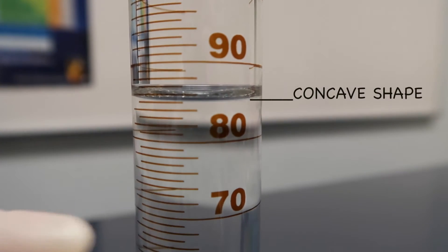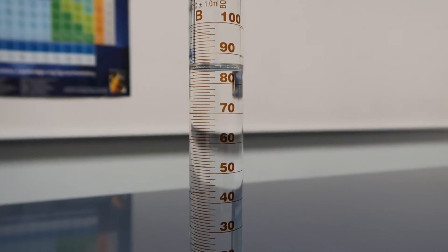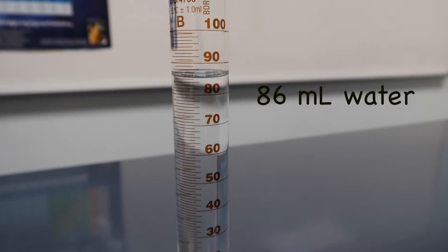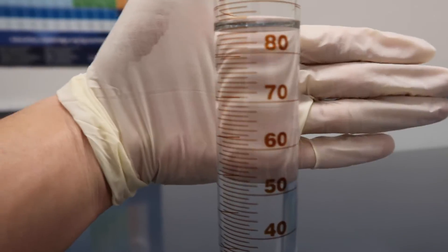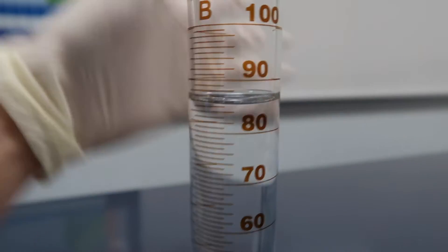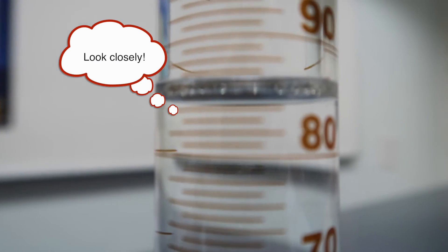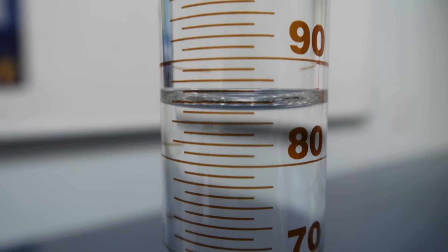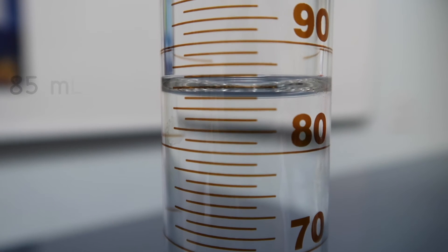That's why we have a concave shape inside. It looks like 82, 84, it looks like 86. So here, it looks like 86 ml. But if you look carefully at the lower meniscus, here it is. It's not 86, it's 85 ml.